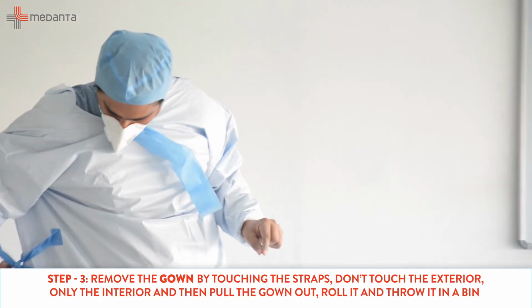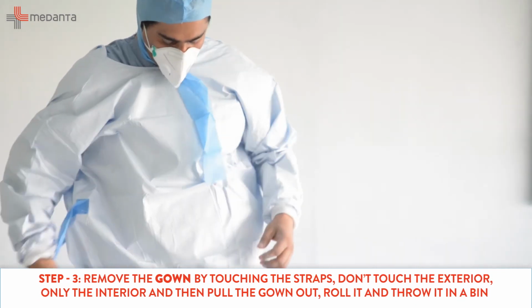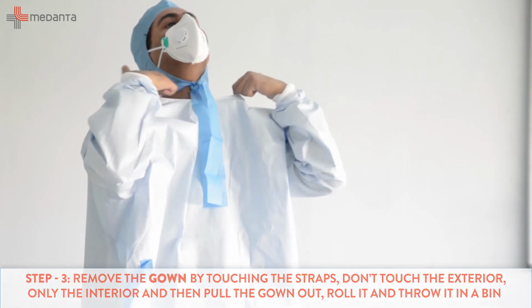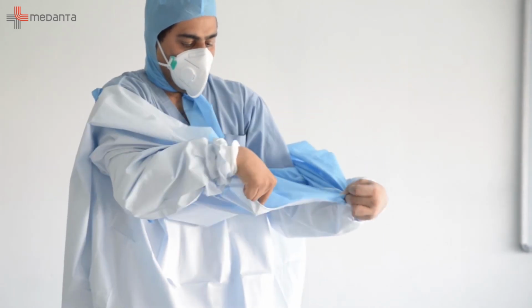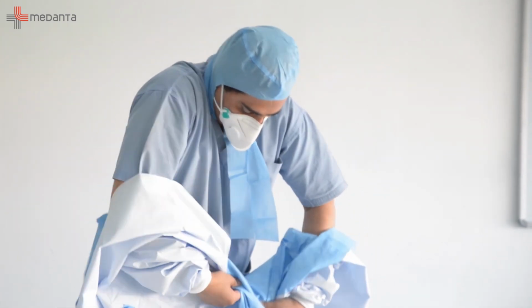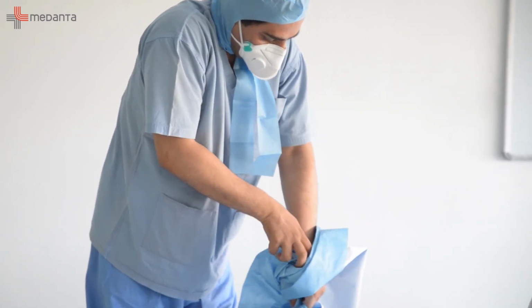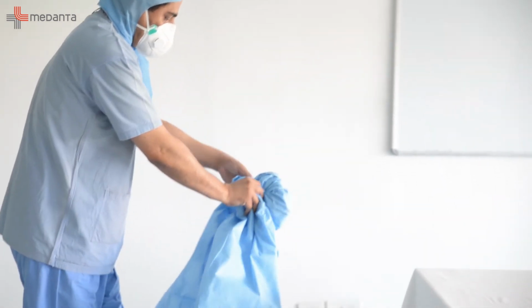Third thing to come out is the gown. You can touch the straps but don't touch the exterior of the gown. While touching the interior of the gown, pull the gown out. Pull it inside out. While touching the interior, you can roll it and throw it into the correct bin again.